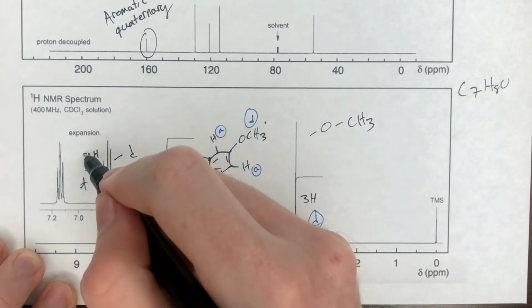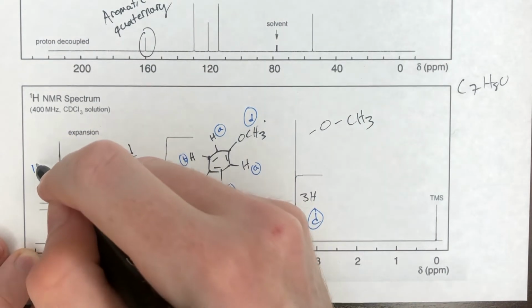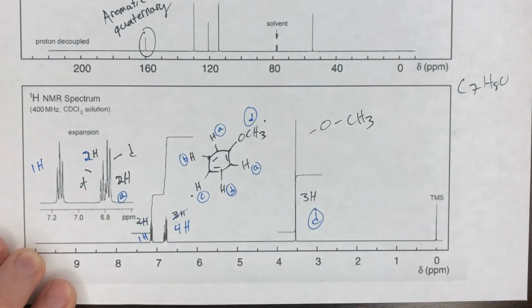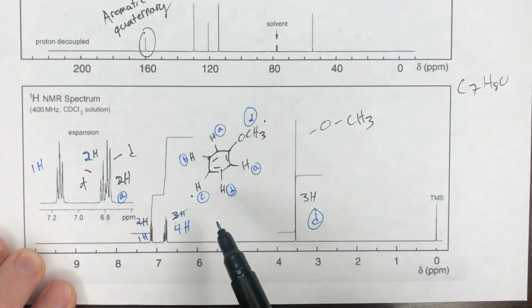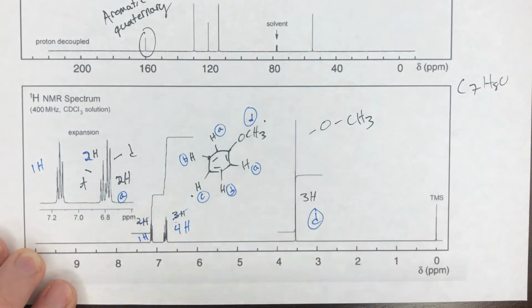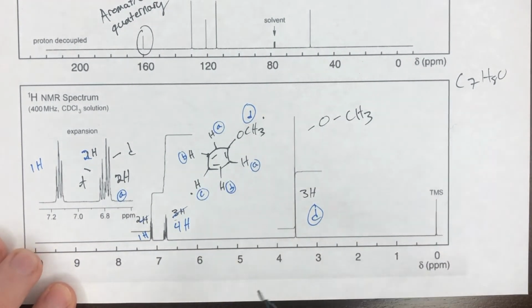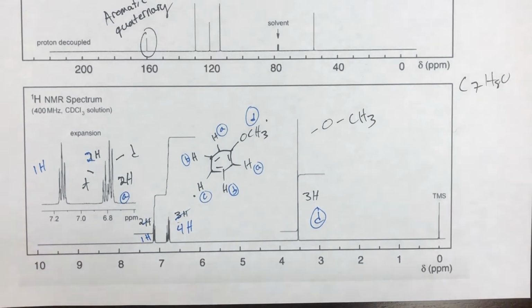As here we have the 2 hydrogen triplet as I thought as I was solving this, and this is only a 1 hydrogen peak here, which then makes sense because the proton C here is split by B on both sides, which would make it a triplet because even though they are the same, they are splitting a different proton. So as such, you would expect multiple splitting there.